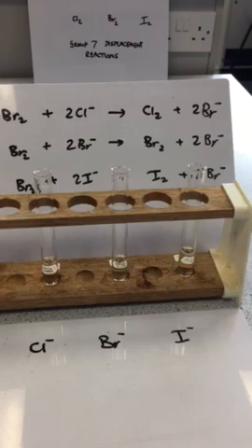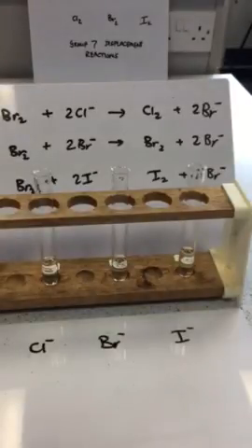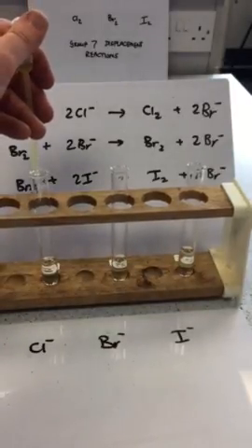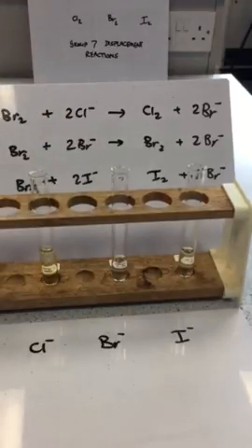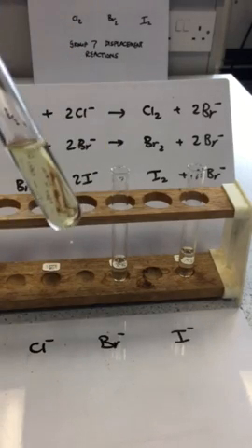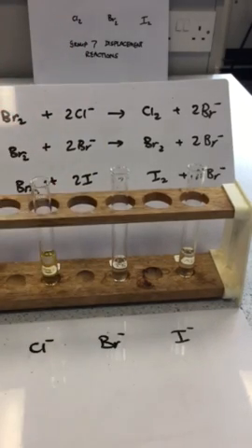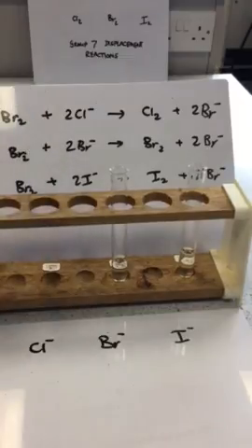So, the first reaction. So here's bromine water. So the bromine water is orange. If the reaction occurs, it becomes green. Okay. Got this colour that looks a pale orange colour. Let's just double check with our cyclohexane. Is it still the bromine colour? It's orange.